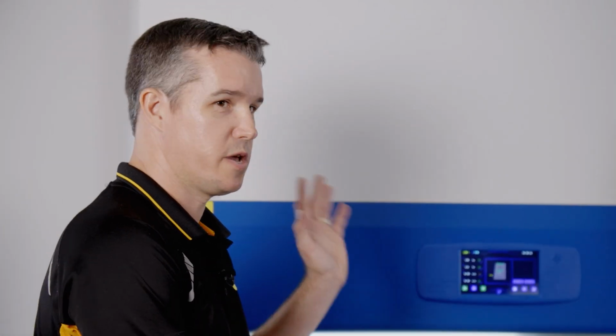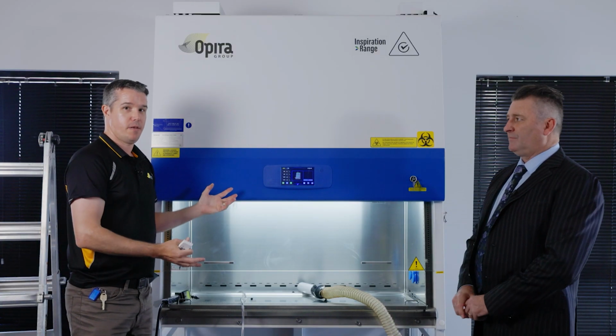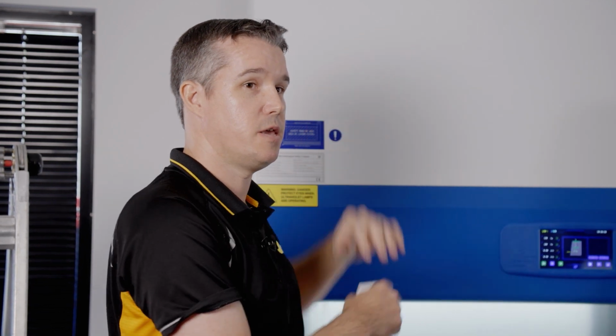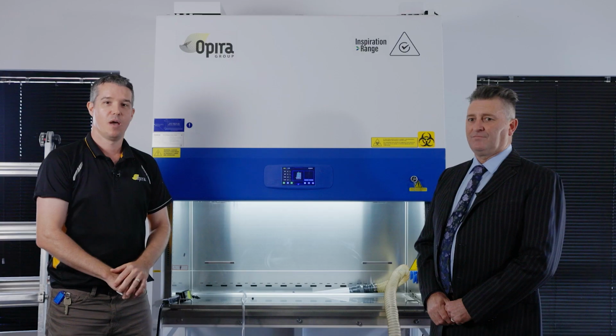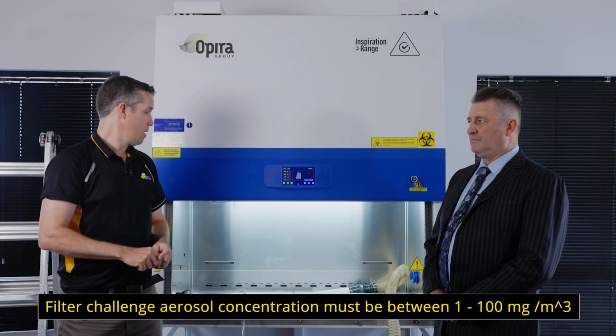If you've had a technician do a cabinet test before, you'd know this. What we're going to do is generate an aerosol into the cabinet, and then test how much of that aerosol penetrates through the laminar flow and exhaust HEPA filters. Once we activate the aerosol generator, we want to determine the amount of aerosol that's challenging the HEPA filters. The reason is that the criteria for a pass-fail of a HEPA filter is 0.01% of that 100%. We've got to measure that to confirm that it's meeting the requirements of the test method, which is that it's got to be between 1 and 100 milligrams per cubic meter of aerosol.